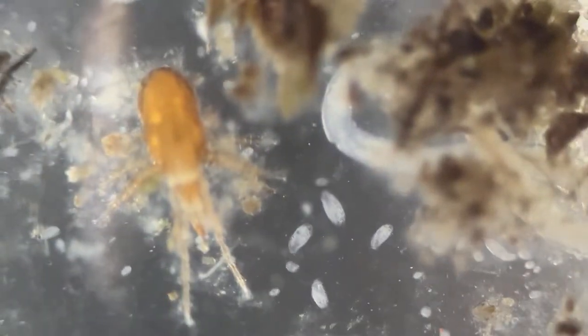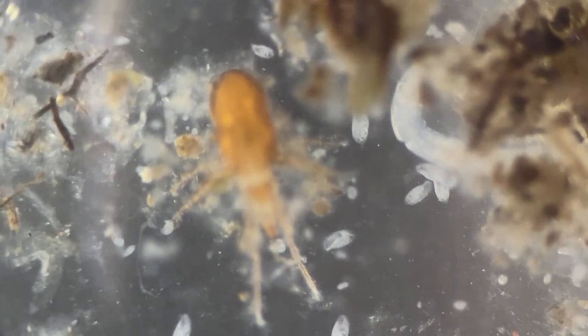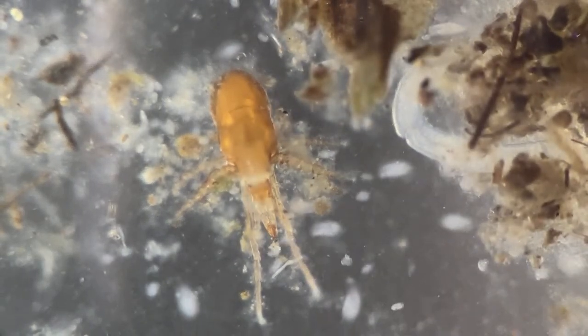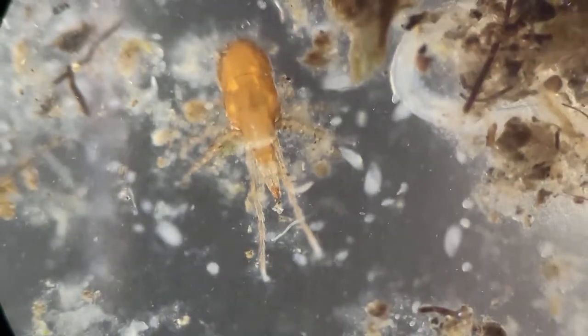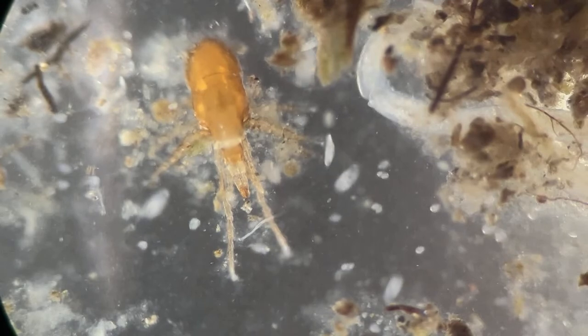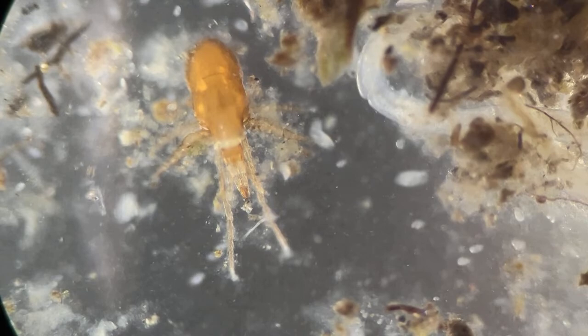There is the tick. Now we wouldn't have been able to make out this surface structuring. It's like a scanning electron view on a very, very primitive magnification.